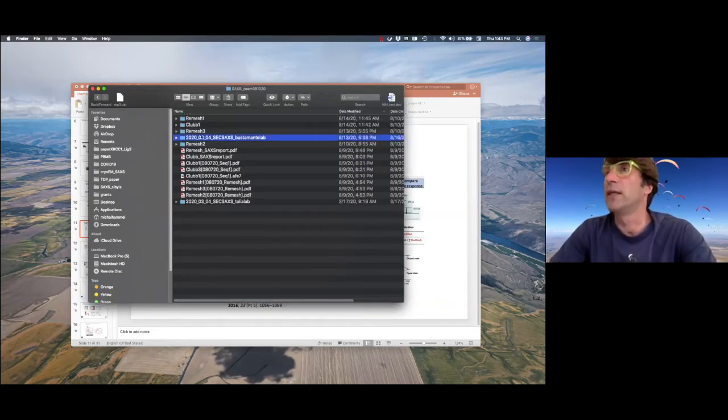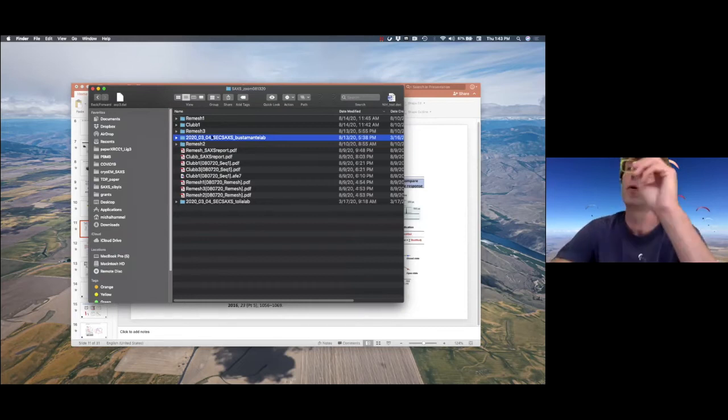You can find it in your subdirectories, in your home directories on the server, and you can take it from there to your own computer. It stays there forever because those packages are not big. There are no raw images involved in it. The raw data is separate; we're not talking about that.